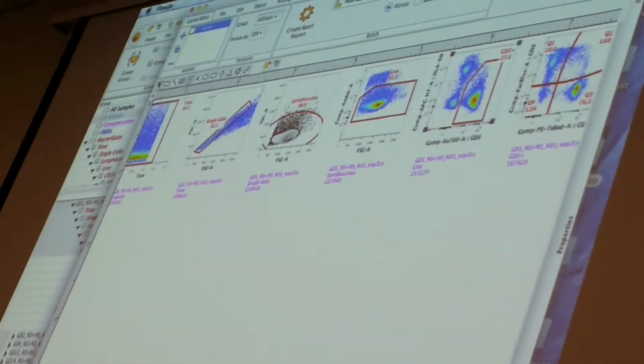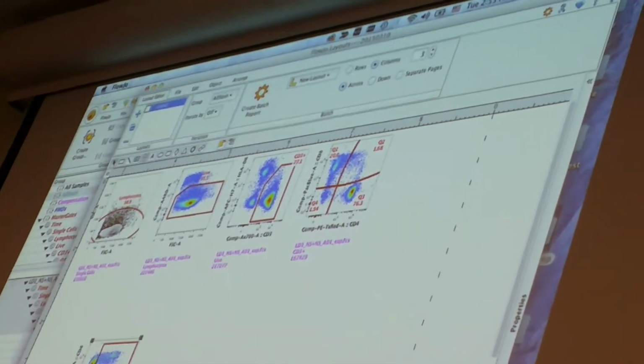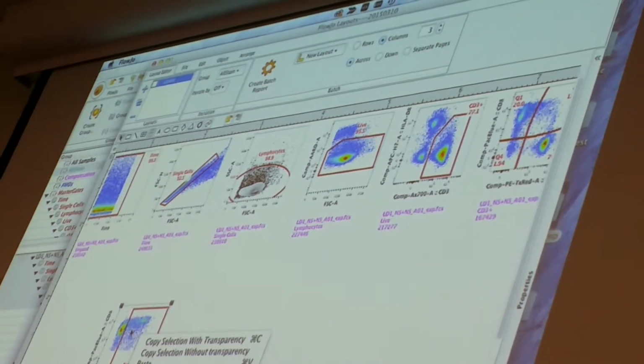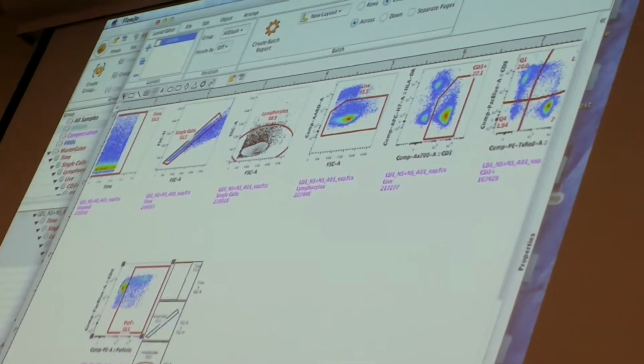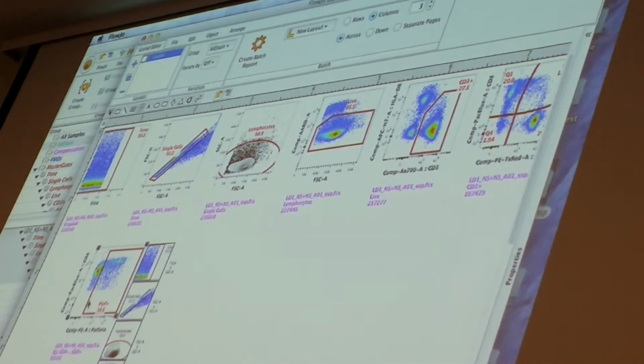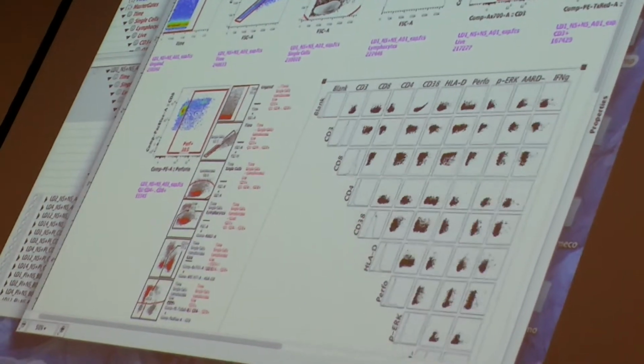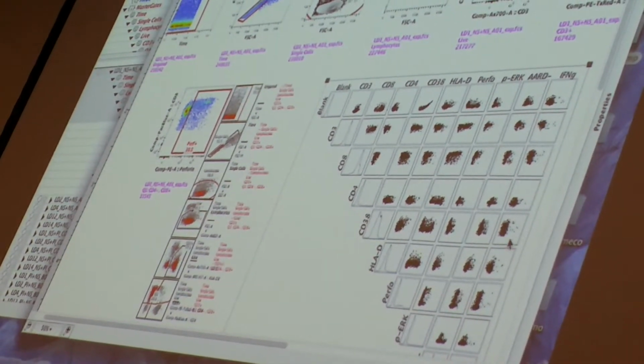If I want to make it even simpler on myself to show a gating tree, I can take my CD8 positive T cell population, instead of showing all these full-size plots, I can right-click, go down to Ancestry, and it'll show me thumbnails of my entire gating tree, and I can match that. So it's a one-click Ancestry. It's a right-click away. You can also change that, show the backgating for that population. You can also show all your n-by-n plots. And I can blow those up if I want to show all parameters against all parameters. For right now, I can unselect that if I choose so.